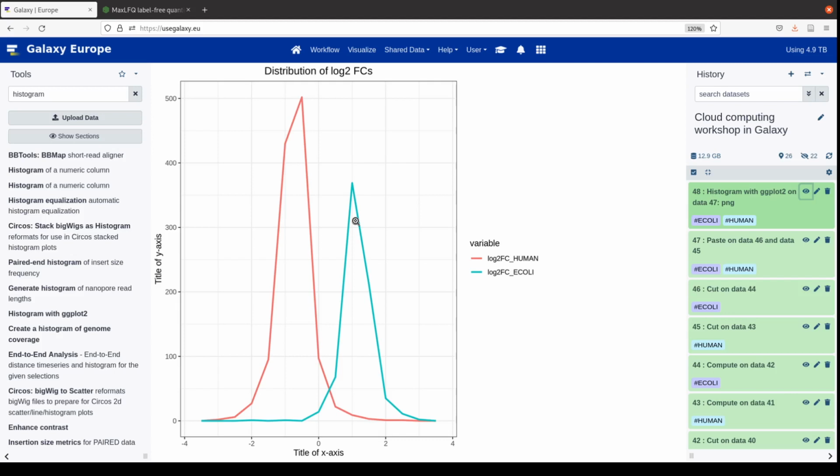But as we have seen in the TPP workshop, E. coli 30 have higher intensities than E. coli 10, and there are reasons why it's not exactly the 3:1 ratio. And the human are around minus 0.8, which I think makes also sense.